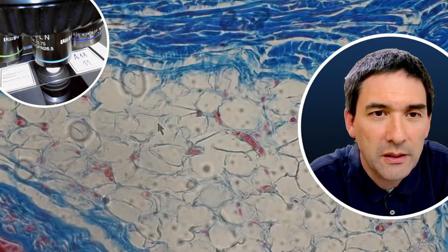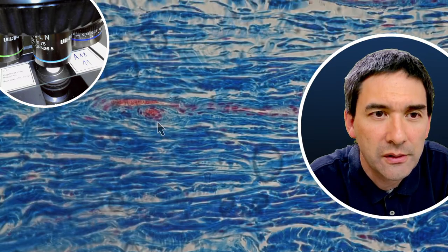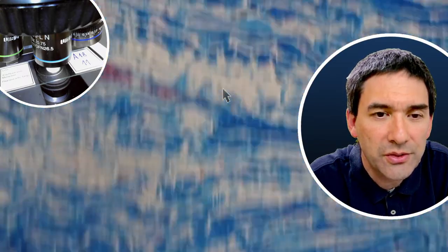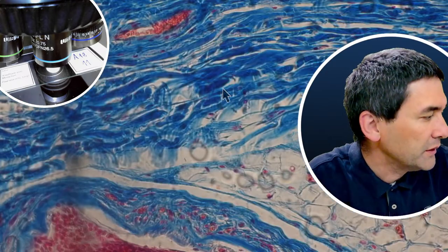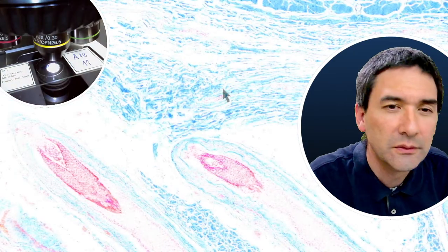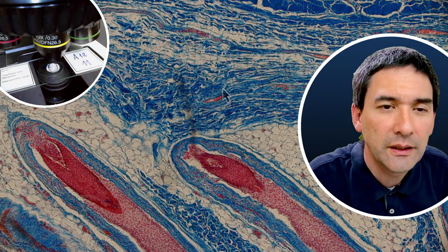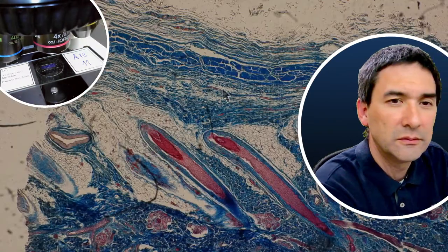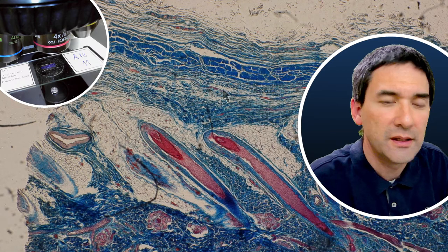This seems to be a fat tissue, yeah. And then occasionally, if we're lucky, it could be that this is a blood vessel over here with blood cells. But very nicely visible, the different layers that you're able to see here. I think we go down a little bit with the magnification to get a better overview. Or maybe even lower. I think that's much better.